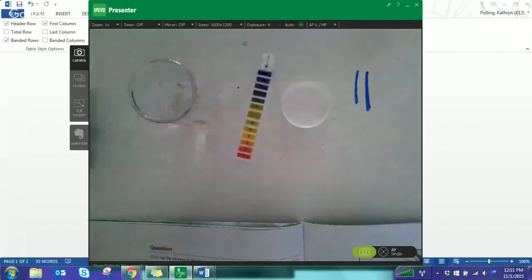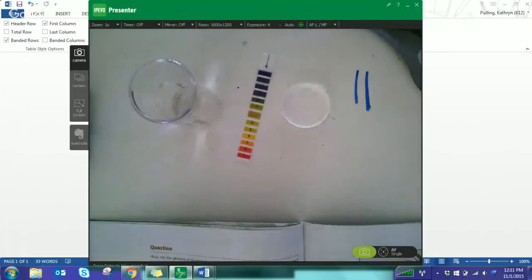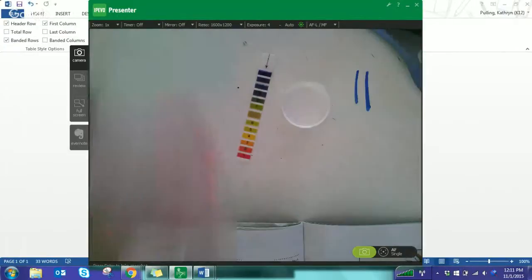All right. So, looking at that center range, honestly, I'd say the color is probably somewhere around 7. It's not quite 8. So what this is actually making me think is that maybe I had too much and maybe I just needed 1 drop.